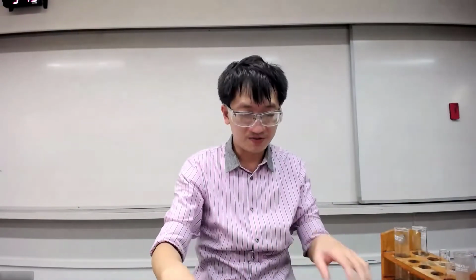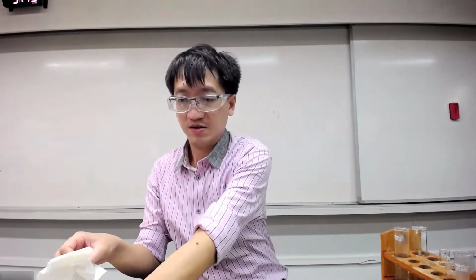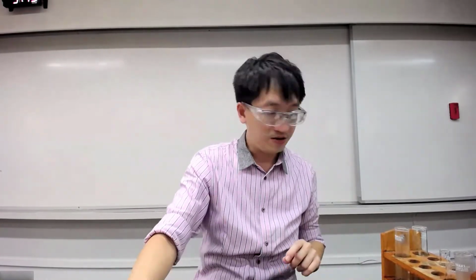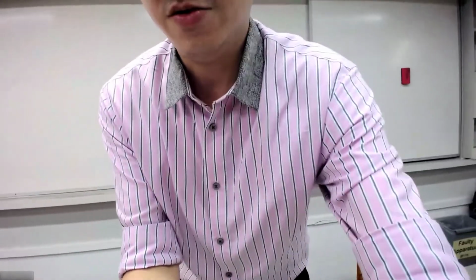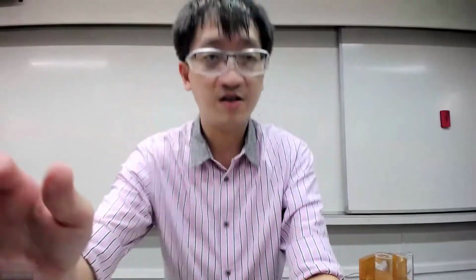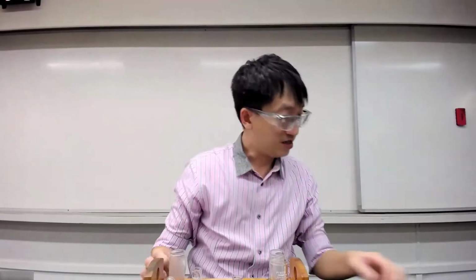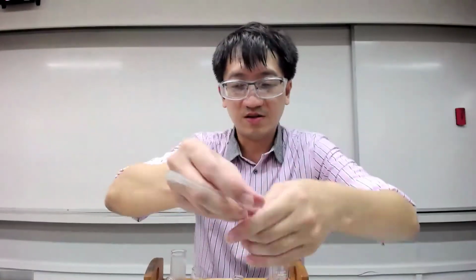I'm going to shift this away because it's a bit dangerous to have it here. I'm going to reposition my things a little bit. Just pardon me for the delay. Back to this. Just hang on for a little while. My apologies, just going to put things in a good order.